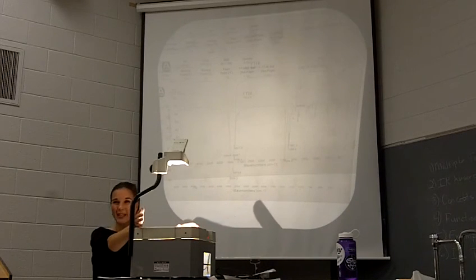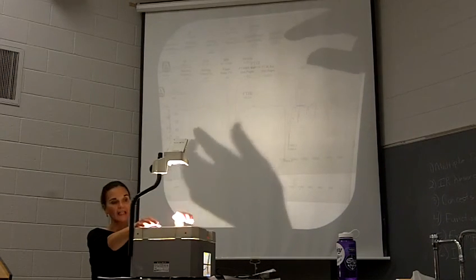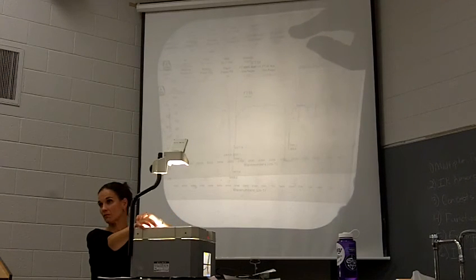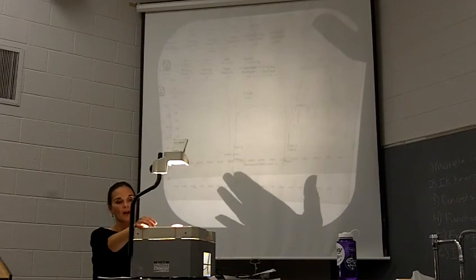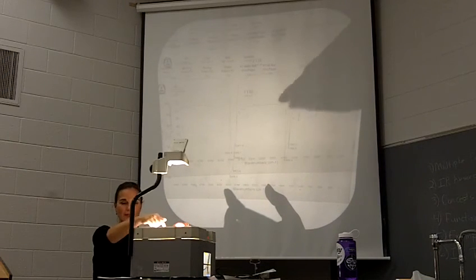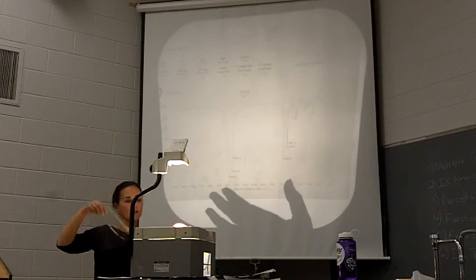So when you are looking at spectra and you are deciding if something matches the spectrum that you have, it needs to match in the diagnostic region as well as the fingerprint region, okay? If it doesn't, then it's not a match. And as far as a match, you should see the same peaks at the same frequency with the same relative intensities.